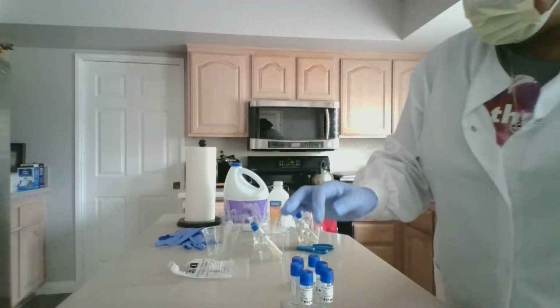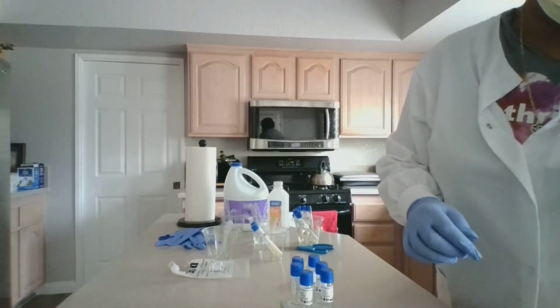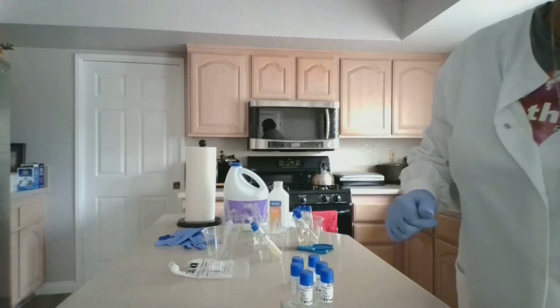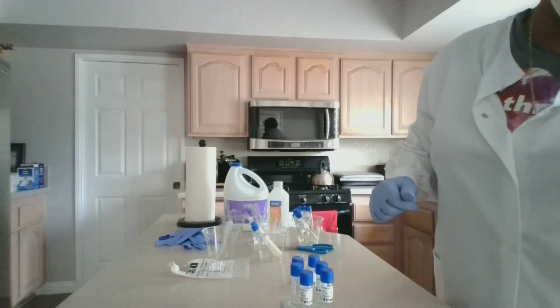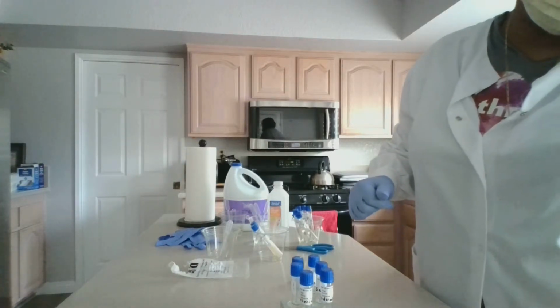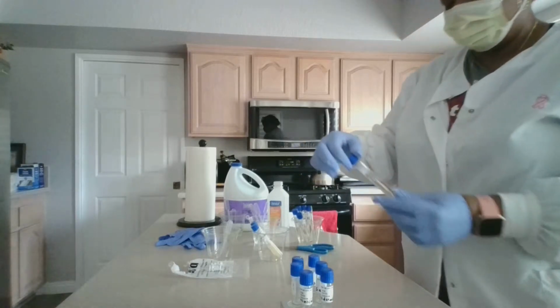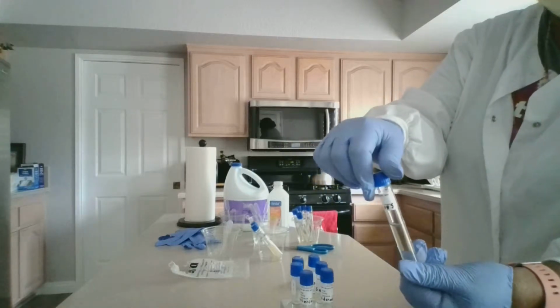And now I'm going to move on to the demonstration in regards to part 2 of this experiment, for the salt tolerance and pH testing. And I'm going to get my tube for the yeast as well, and I did label it pH 5. This is, you can see, pH 5.